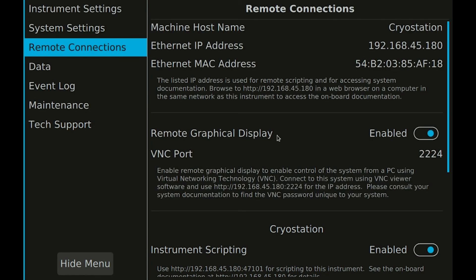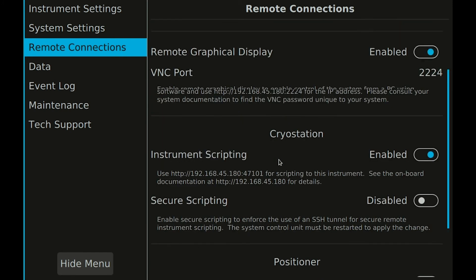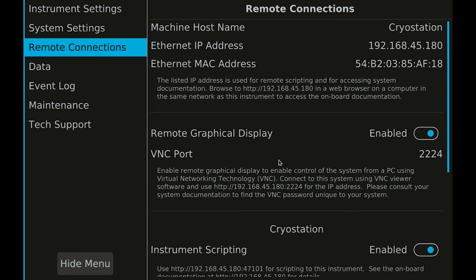The remote graphical display feature can be enabled to allow you to operate the user interface from your computer using virtual networking technology. Instrument scripting can be toggled on or off for each individual instrument in your system. Instrument scripting provides programmatic control of your instrument and is very useful for real-time data logging and remote scripted control synchronized with your other lab equipment. Your system's IP address and MAC address are also found here. Additional onboard service notes and documentation about controlling your system remotely can be found by navigating to your system's IP address in your web browser.